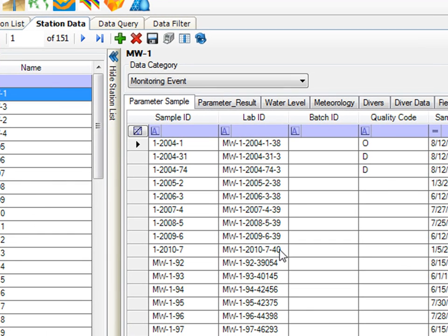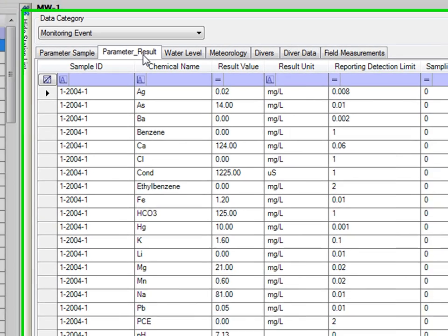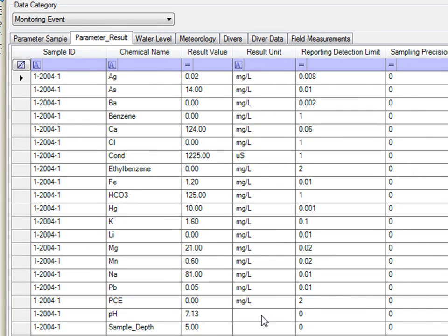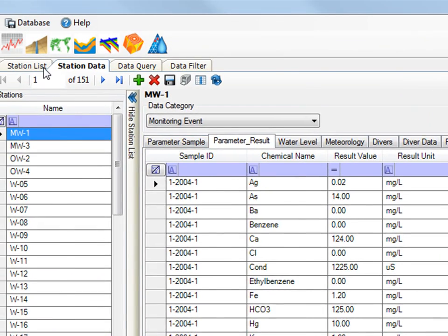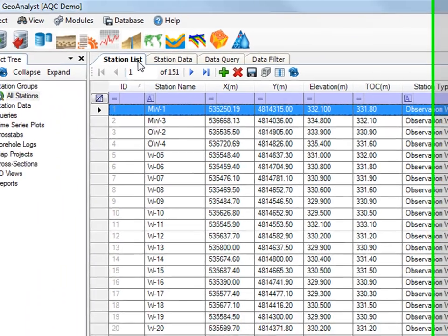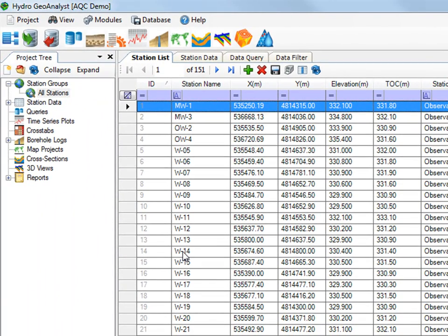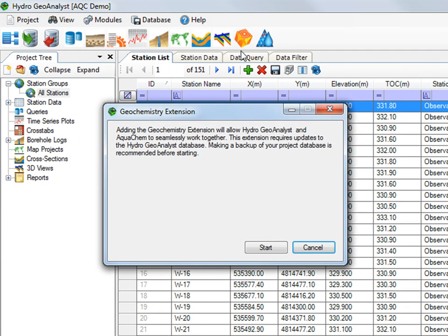I've added some sample information as well as some result information. I would like to have this information all brought over into an AquaChem project. I do this by selecting the AquaChem icon from the main toolbar and you'll notice that you get the geochemistry extension.